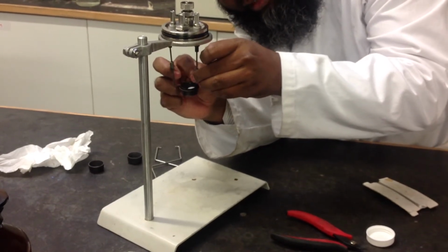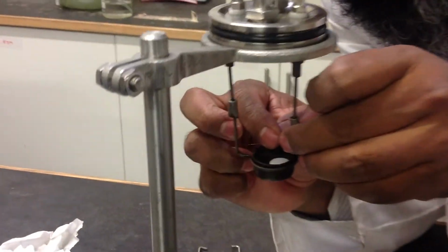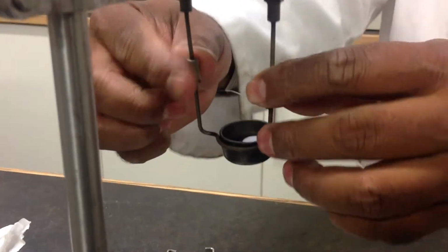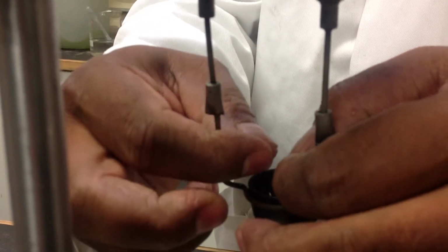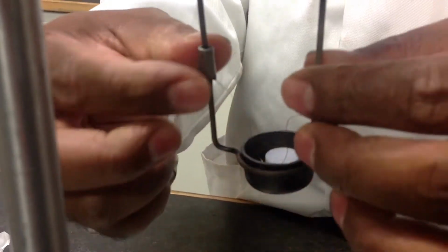There are two tiny holes on both electrodes, and then connect this fuse wire in such a way that it does not touch the sample or the crucible.